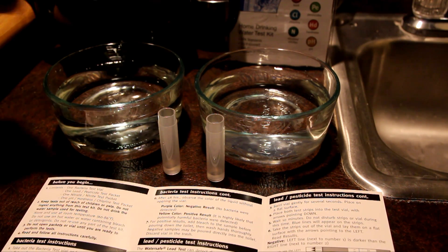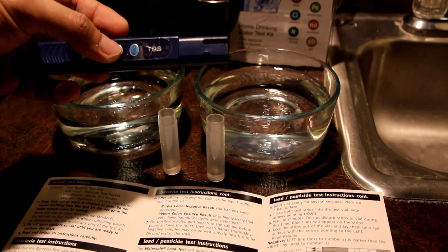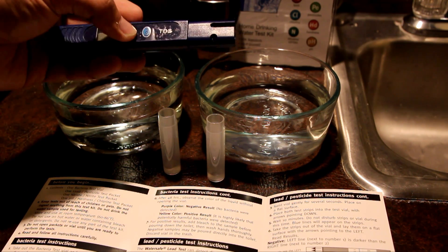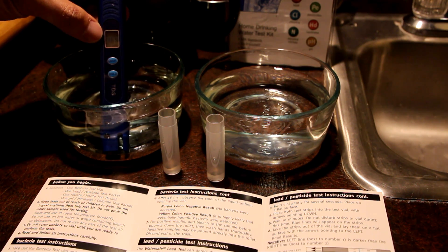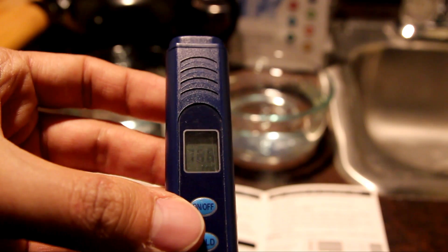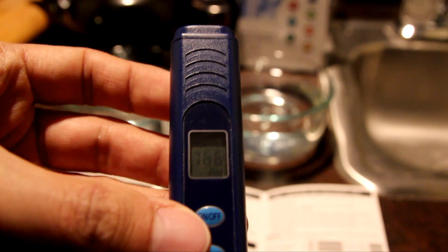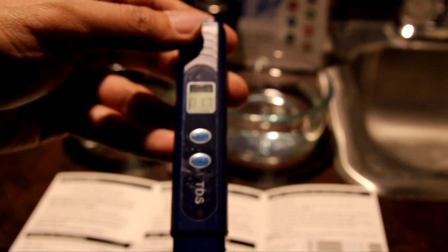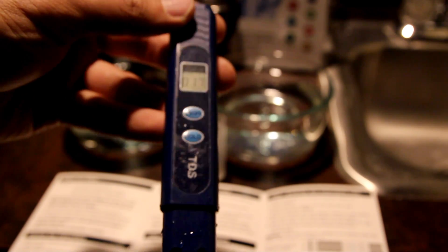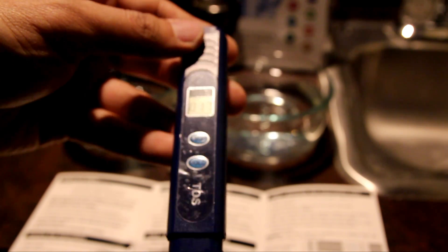Finally, I'm using a TDS meter — total dissolved solids. For the city water, it reads 166. For the reverse osmosis filtered water, it reads 17. It's been almost six months since I replaced the filter, so it's about time. Normally after replacing the filter, the TDS drops all the way down to five.